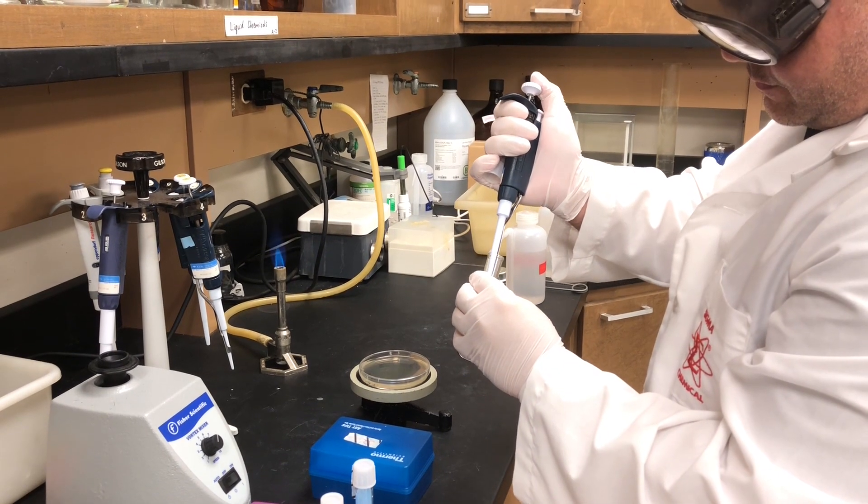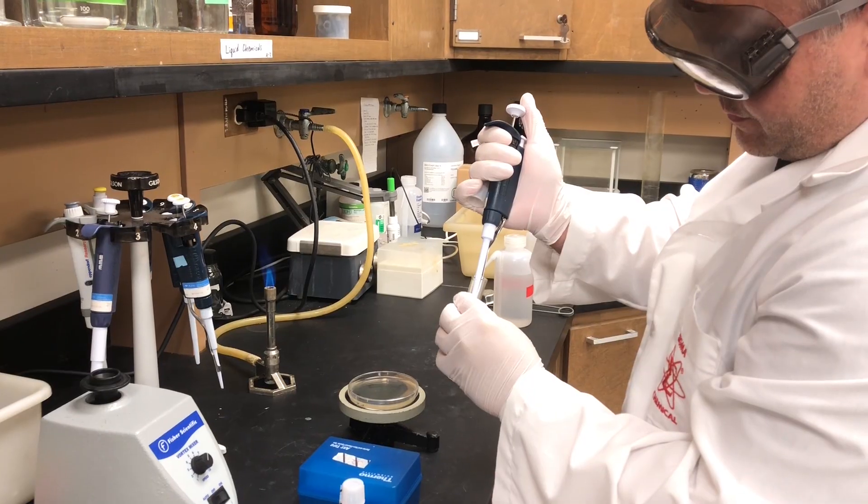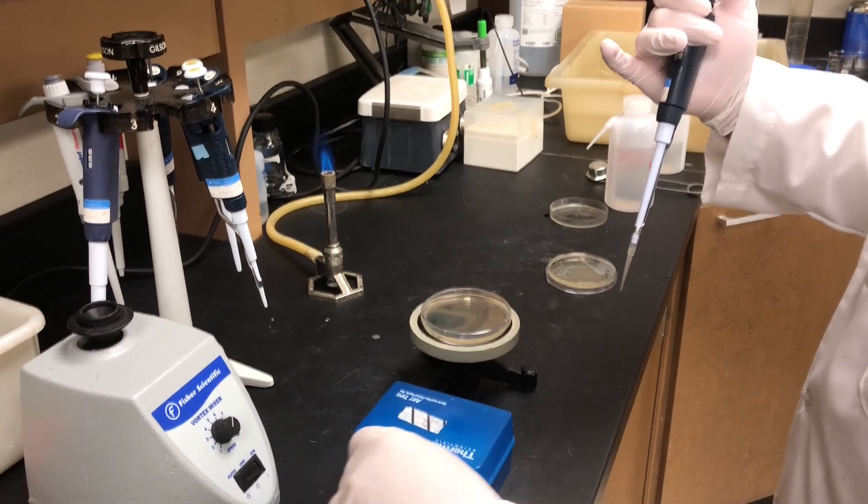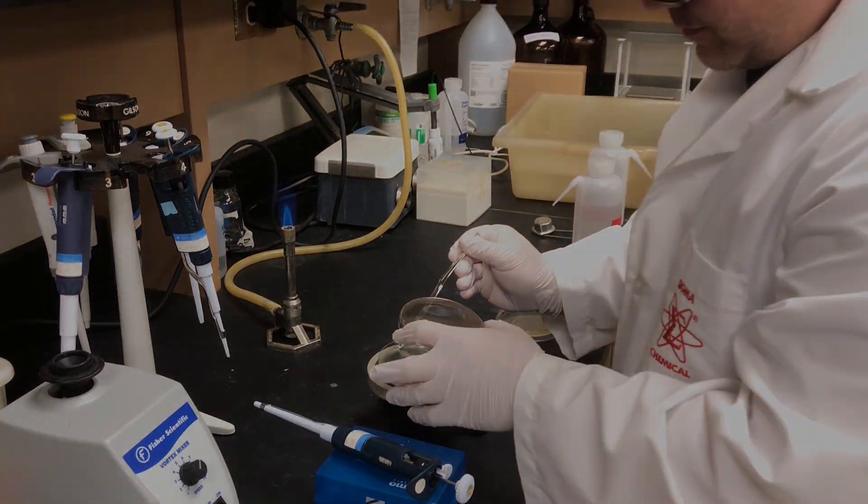Then plate 100 microliters and 200 microliters on LB plus the designated antibiotic plates. And incubate at 37 degrees overnight.